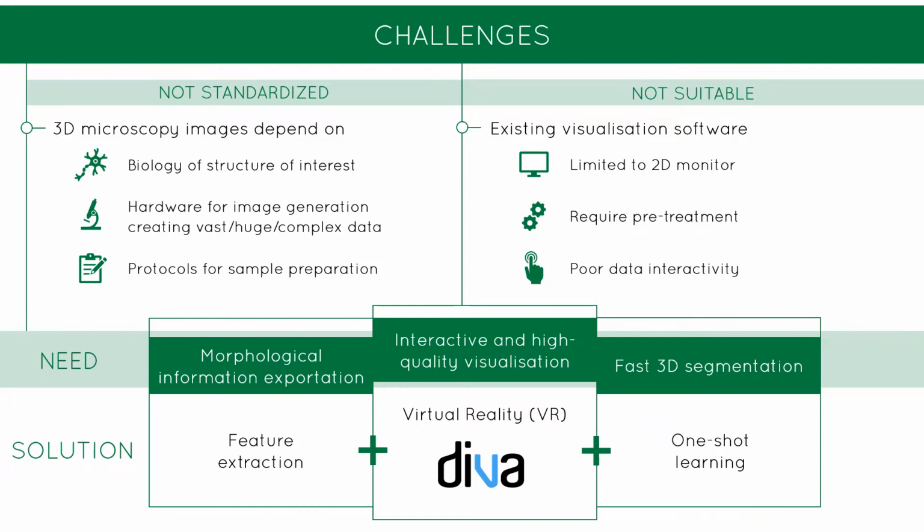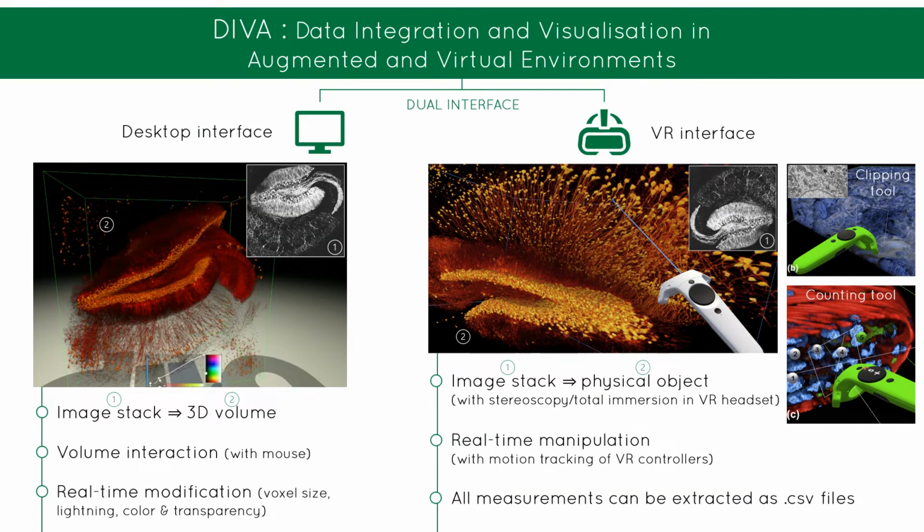In order to answer this challenge, we developed in the laboratory an interactive and high-quality visualization tool called DIVA using the virtual reality environment. We combine this software with one-shot learning and feature extraction in order to do fast 3D segmentation. Now I will present you the DIVA software.